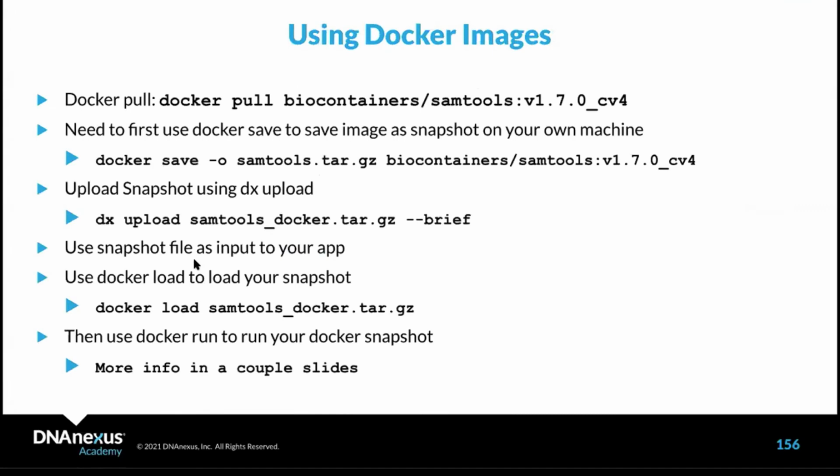Okay, so that's basically how you install lots of different packages. But how do you install with Docker? You use Docker in your applet. This is kind of a process. Anastasia showed you one way that you can have a docker pull command in your script.